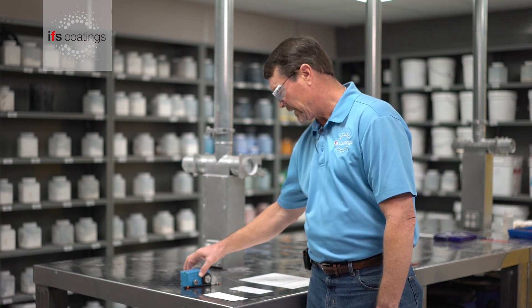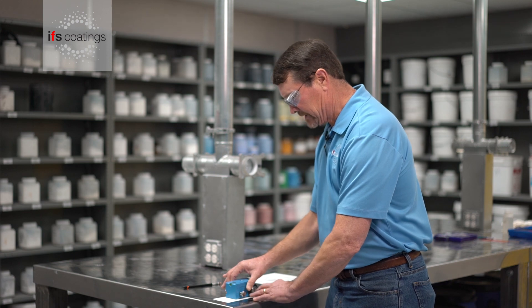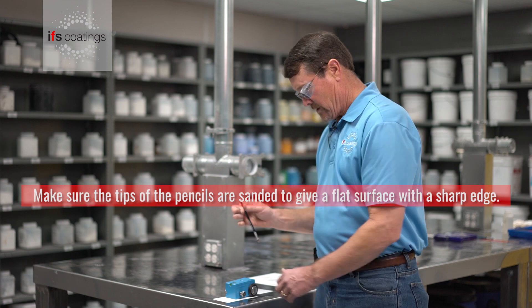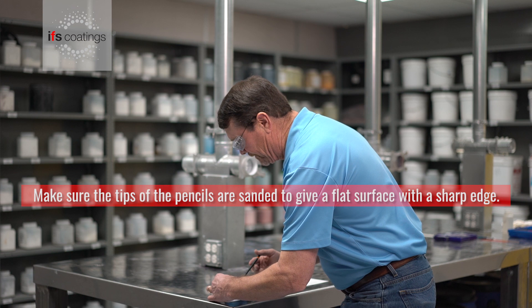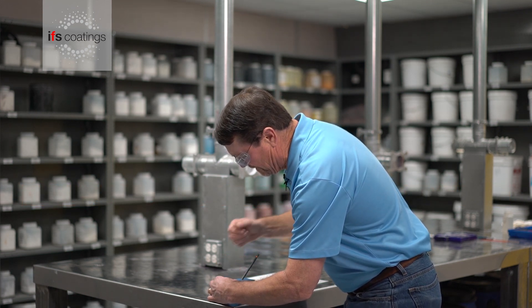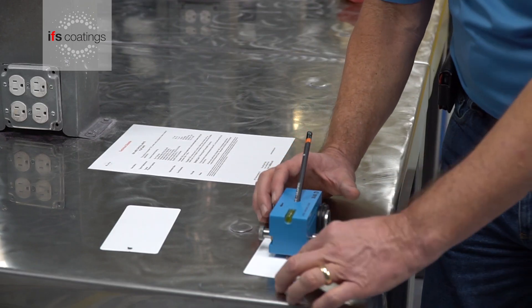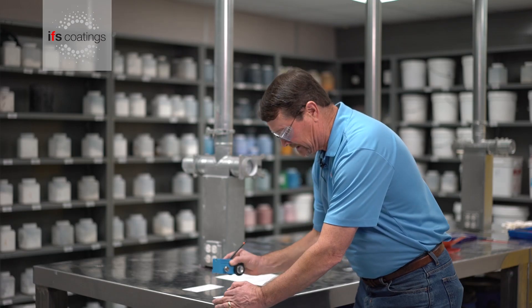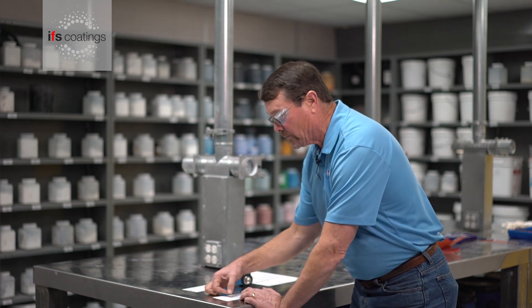We're going to use this mechanical device to do the testing. It allows us to apply a known weight with the pencil. We'll insert the pencil into the machine, level it out, and then push it along the surface to see if we get any gouges when we do the test.